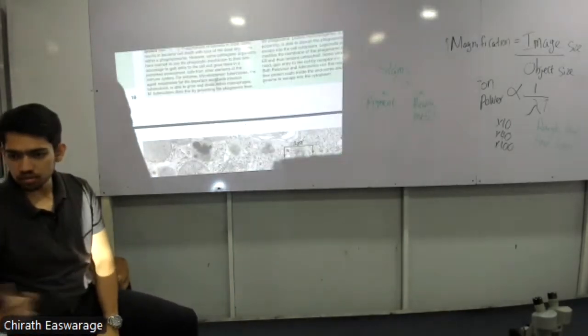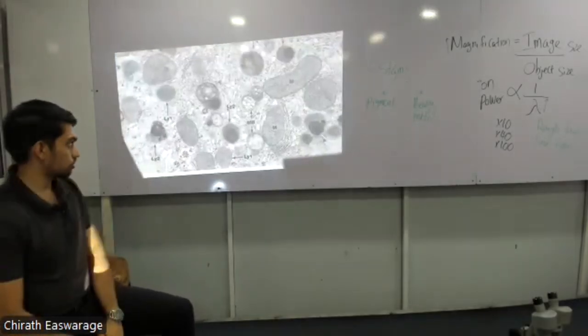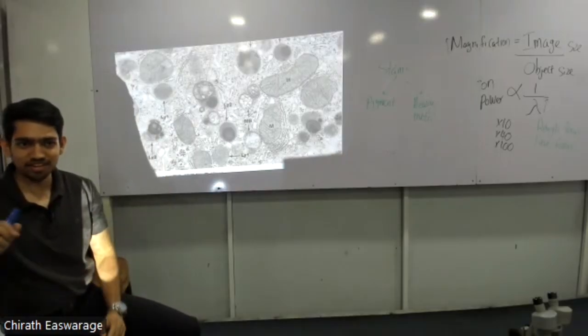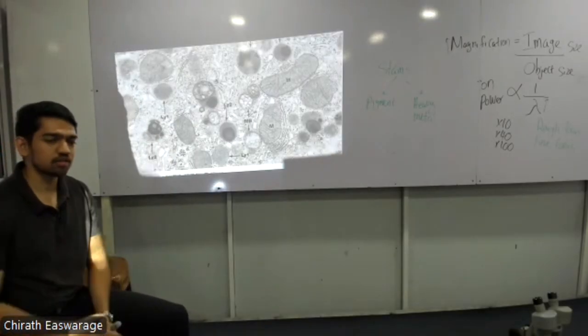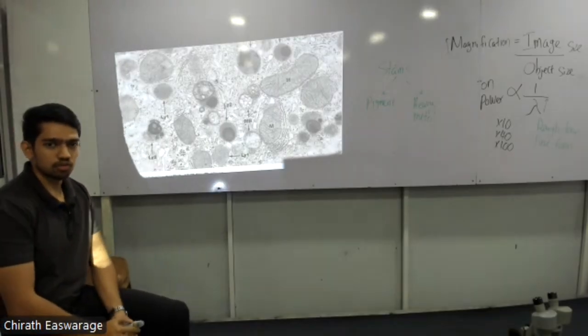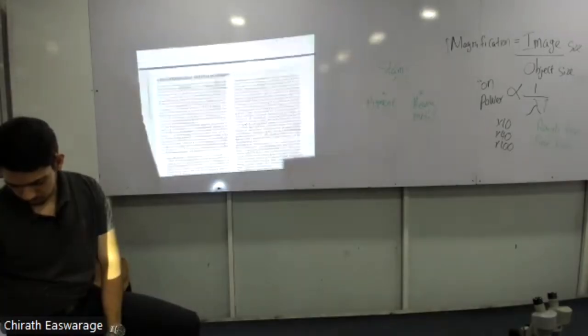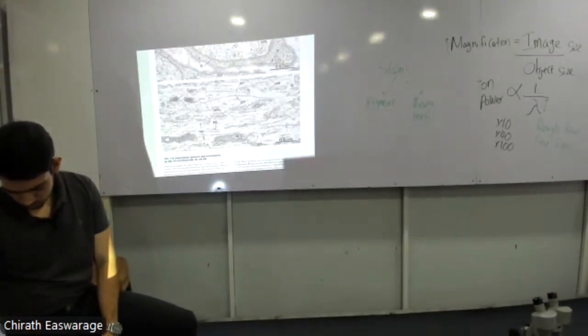This is a practical, okay? In the practical guide, you have a practical called observation of electron microscope images. In your school labs, you will have a laminated file with some electron microscope images. Those are standardized ones. You can clearly see the structures, if you go to school.